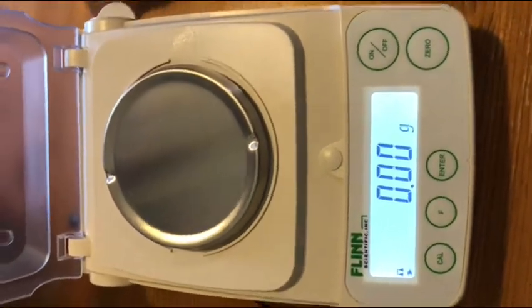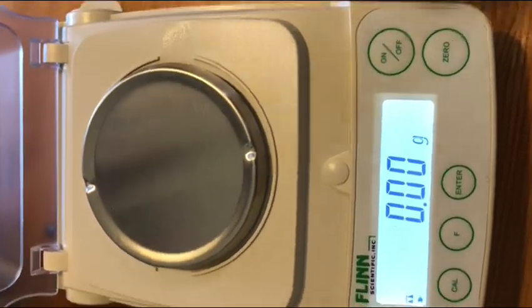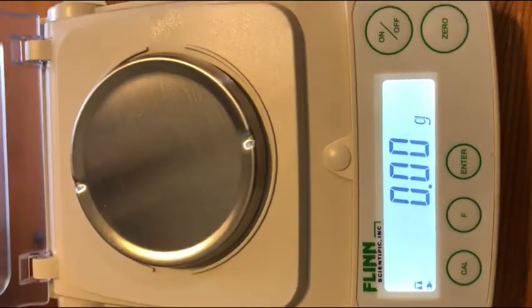Well, here we are, finishing up our copper and silver nitrate lab. Wanted to show you what the silver looks like. Hopefully you can see it's kind of sparkly. Also, I want you to notice that there's a little bit of green, not too bad. I did a pretty good job on filtering. There's a little bit of green on the edges of the filter paper, but we're gonna get our final mass now.